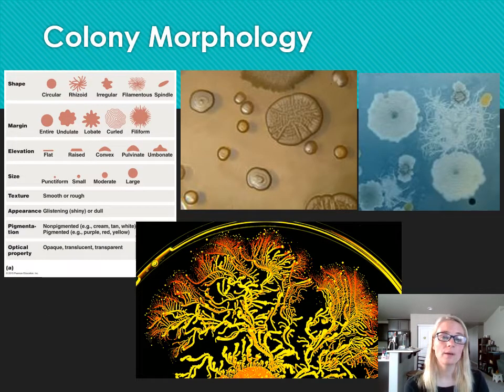So when you grow bacteria on the surface of agar, like in a petri dish, you can observe what we call colony morphology. Colonies are the little clusters of bacteria that are growing on the petri dish. Morphology is their appearance, the colony morphology, as opposed to cell morphology, like we could determine with staining, like we learned in Chapter 4. So just like your cell characteristics, if it's a bacillus or a coccus or a spirillum, if it's gram-positive or gram-negative or acid-fast or something like that, those are all characteristics you can use to help identify an organism based on the cellular things.